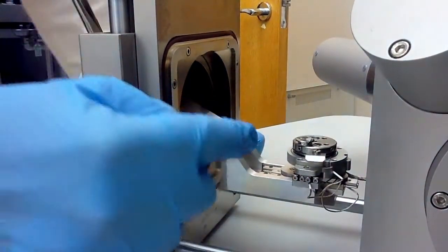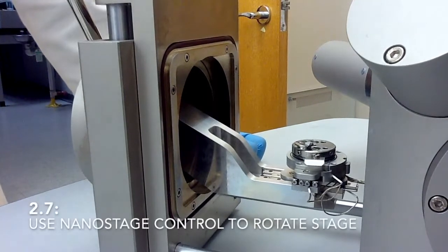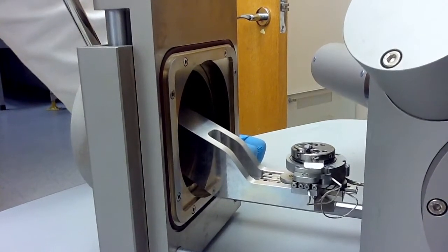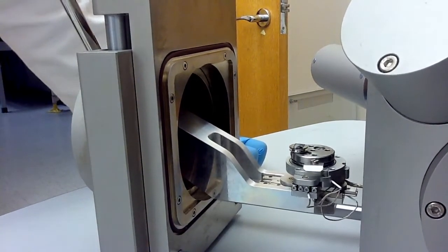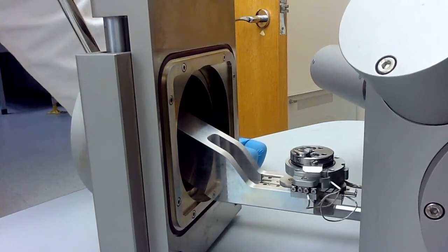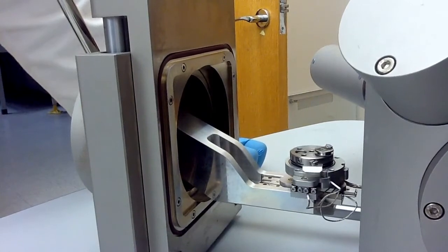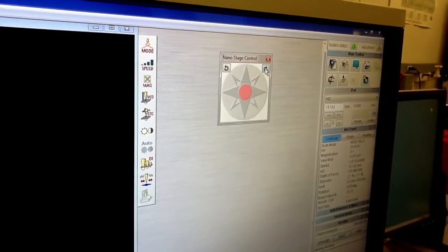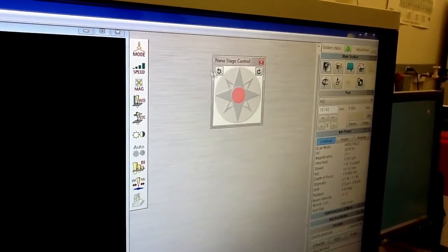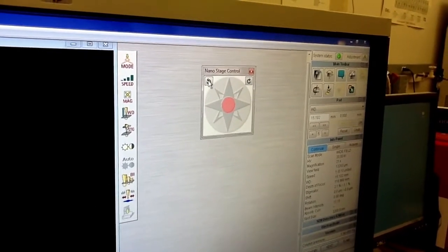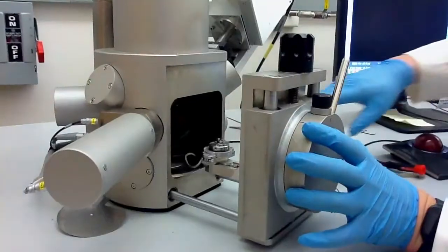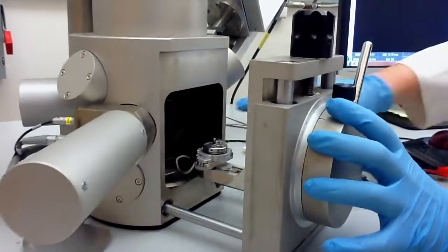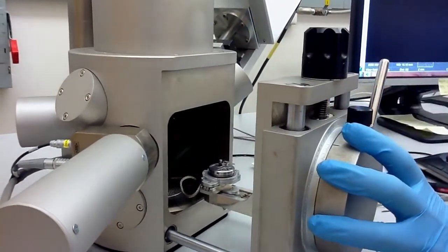Also if you don't have access to this hole you should use the nano stage control and rotate it. This is how you rotate the stage either clockwise or counterclockwise. If you use this icon you will rotate clockwise, and you can rotate counterclockwise by pressing this button. If your sample is tall, make sure that you don't hit anything inside — especially the lens or the exit of the EDS detector.